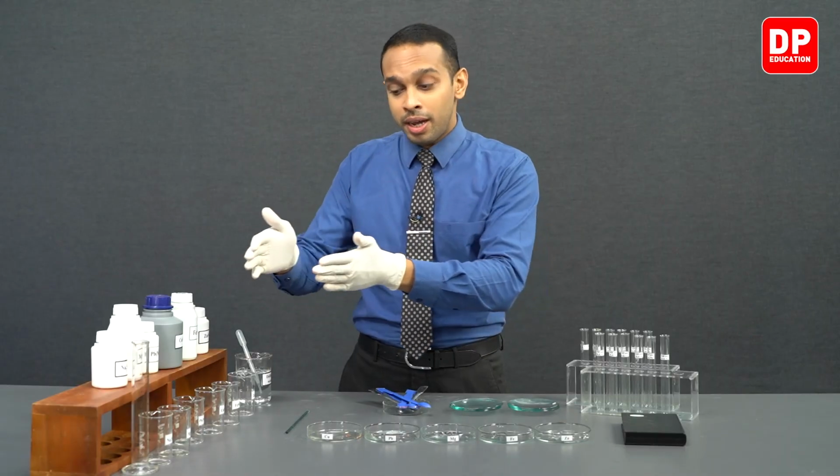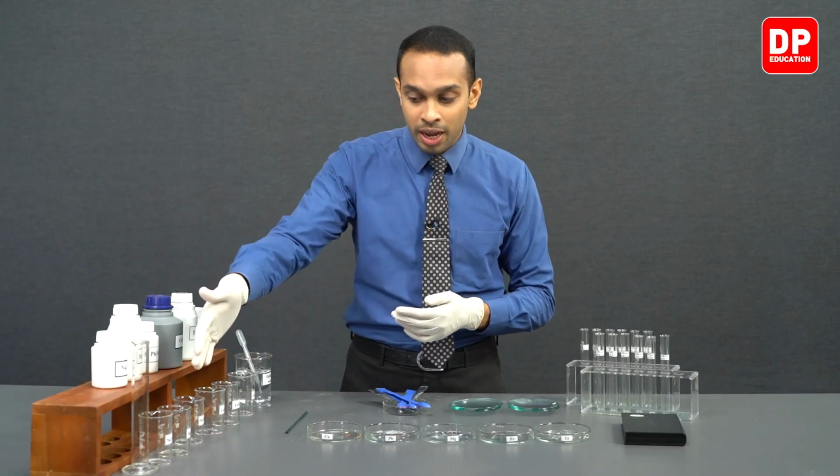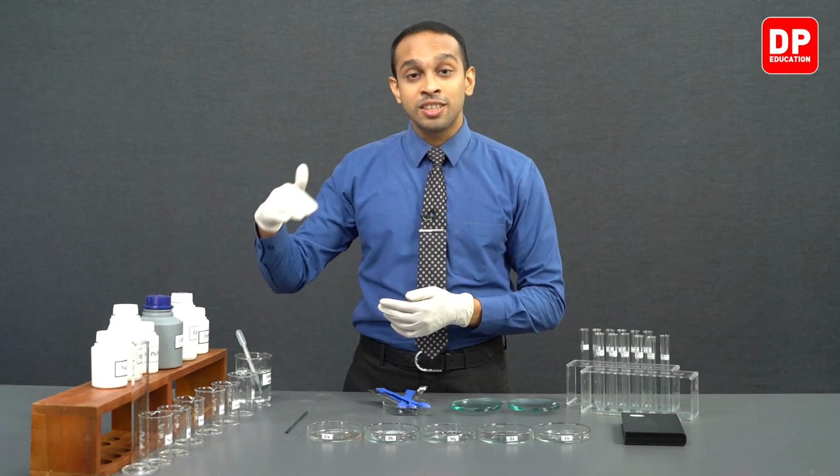So throughout this experiment, we are going to observe how different metals are capable of displacing other metal ions with lower reactivity. If the reactivity of the metal ions in the solution is greater than the metal that we introduced, there will not be any reaction. So students, keeping this in mind, we can now move on to the first step of our experiment.